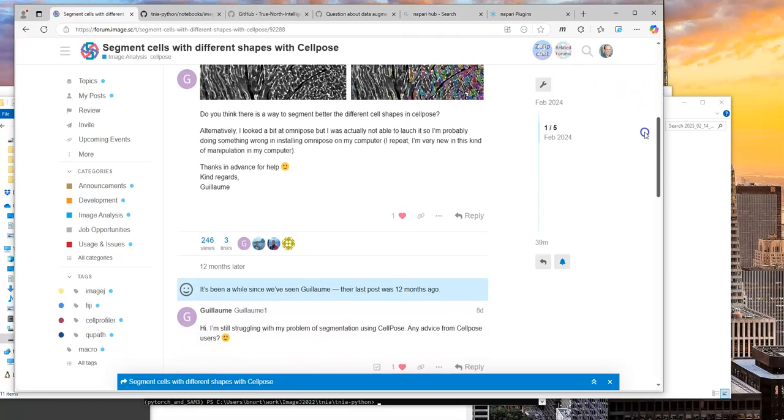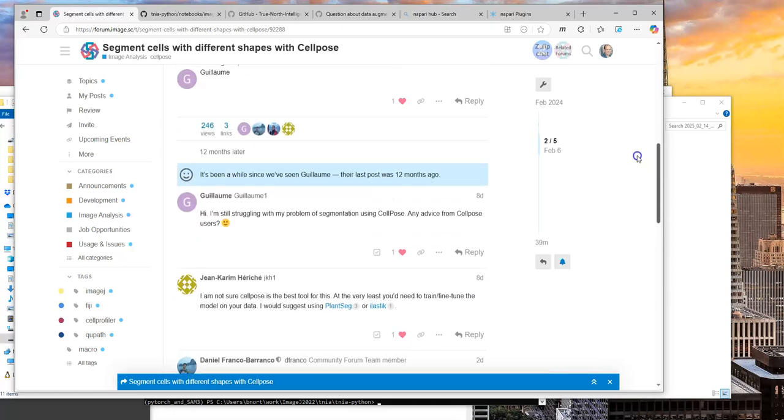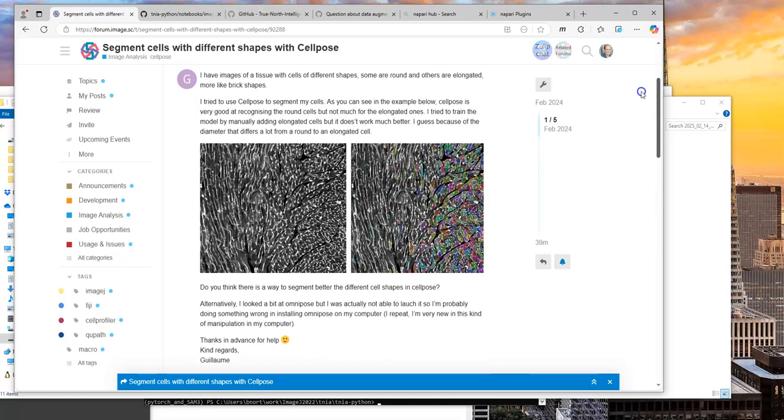This question was from about a year ago. It got bumped recently. Today I'm going to demonstrate how to train a Cellpose model for different scales. And if you've seen some of my videos before, you know I've hit on this topic a few times.